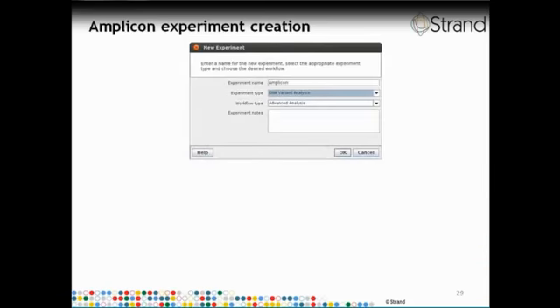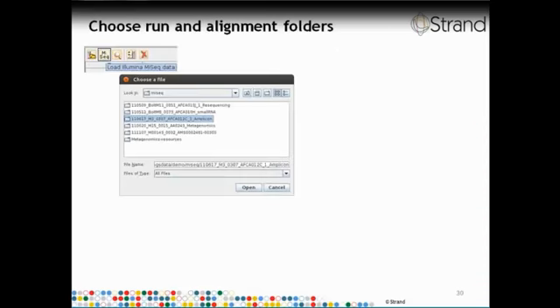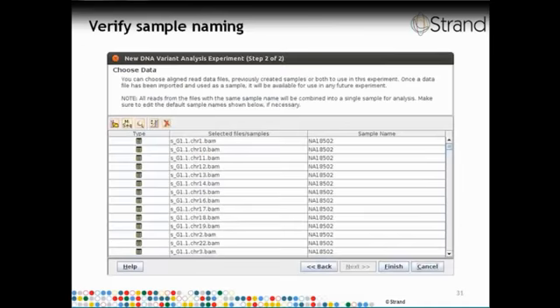In the meanwhile, if you were to run SNP detection within Avadis NGS, it creates a multi-sample report, which is pretty much a union of the variant alleles observed across all the 96 samples. So any allele observed in any of the 96 samples results in a row in the multi-sample report, which looks like this spreadsheet. So if we take a look at the first row out here, it is a substitution of a C by a G, and that particular variant has been observed in only one sample, and we have data about that particular location for each of the 96 samples.